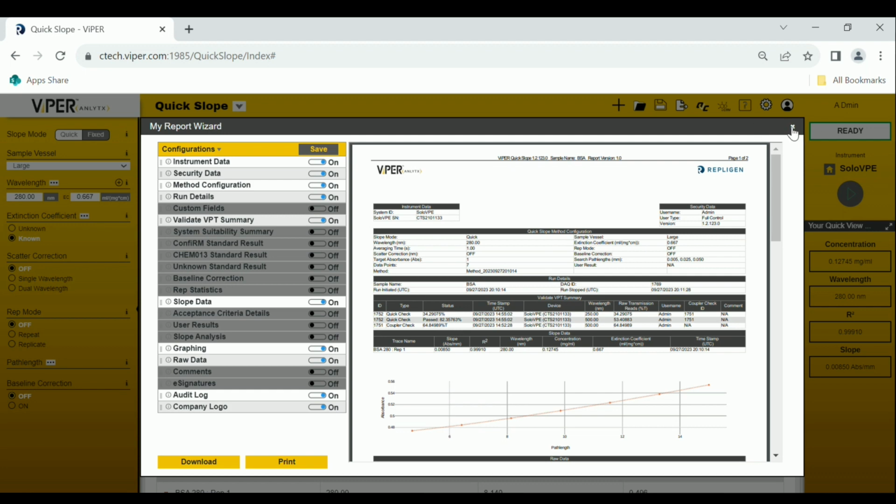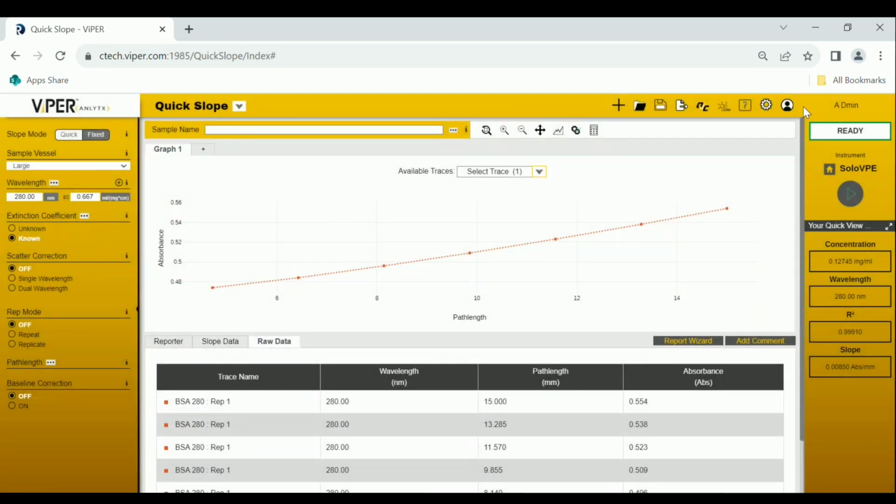And the Viper software uses a SQL Server database, which is electronic data storage. So if you ever want to obtain any of your data in here, all you're going to have to do is click on Open Data, and it should be stored within the computer's database.